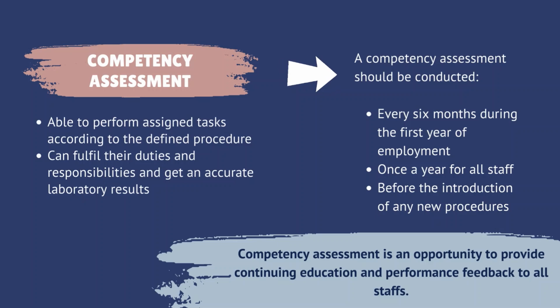Competency assessment. It is the means to confirm that training is effective and that the staff are capable of performing assigned tasks according to the defined procedure, and can fulfill their duties and responsibilities and get accurate lab results.